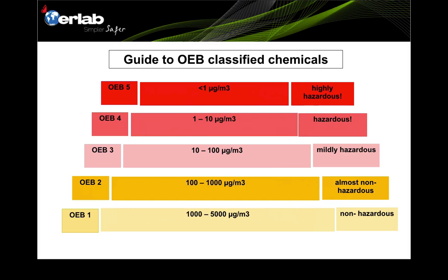As you can see here, OEB 1 is non-hazardous — an operator can basically inhale up to a maximum of 5,000 micrograms per cubic meter of this powder. And you can see that from level 4 and level 5, especially level 5 which is highly hazardous, an operator should not inhale more than 1 microgram per cubic meter. So if a chemical is within OEB 5, that chemical powder is highly toxic and hazardous.